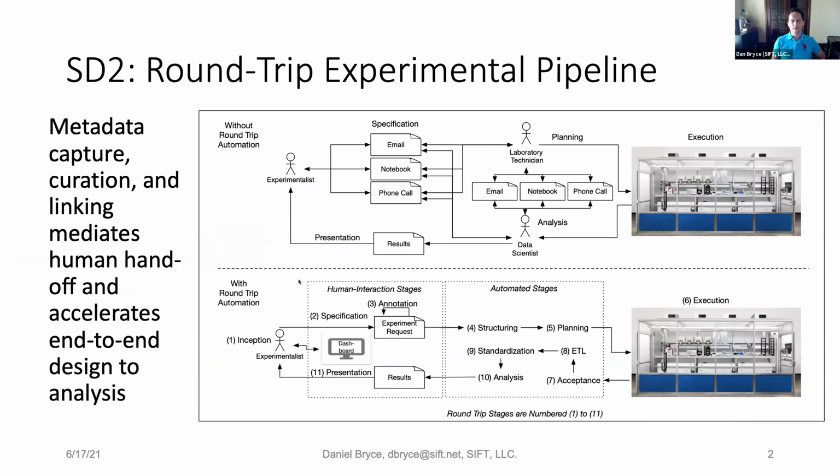The goal that we were trying to address is to remove as much of the ad hoc communication that happens between various stakeholders in the experimentation process, in order to better capture all the aspects of running experiments, and to ultimately speed up the process of generating high quality data sets for experiments. And a lot of the problems that we had prior to developing the software was where we have people communicating and trying to develop a shared understanding of the experiments.